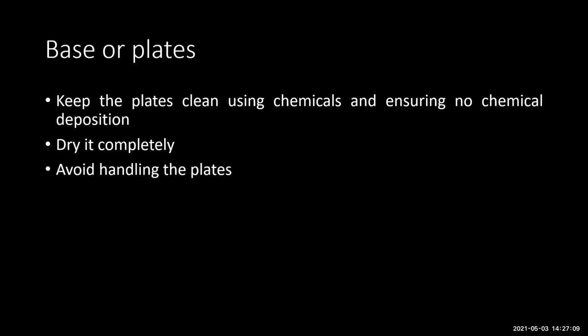Make sure no residues remain. After that, take care in handling the plate. What do I mean by handling the plates? Make sure that you don't press on the surface. Once you do, the possibility of transferring chemical components from your finger onto the plates is very high. That is one thing which affects the analysis. The second thing is you might have to redo all the cleaning and drying again, which will waste lots of time.